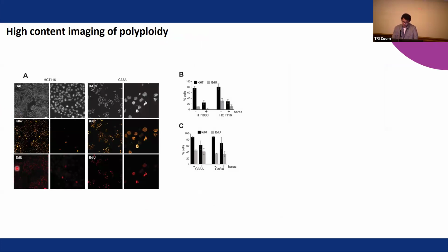So we've got Ki67 and EdU intensity. Ki67 is a marker of proliferation, what Jordan was talking about, and EdU is a marker of replication. So it shows the number of cells that are undergoing replication at any given point. The way I do this analysis is after the images are taken, we segment the cells, and then based on the mean fluorescent intensity of these markers, I can designate them as either positive or negative for these proliferation markers, and then I can represent them in this way.